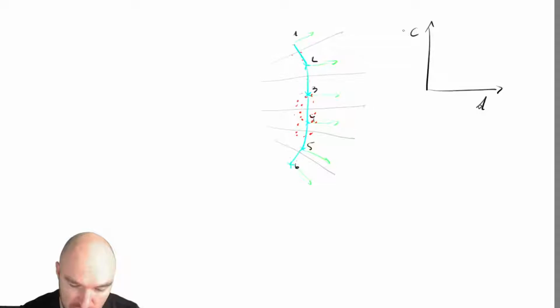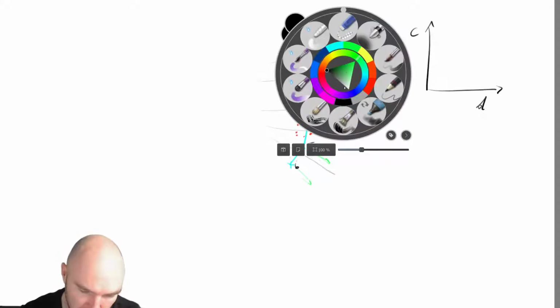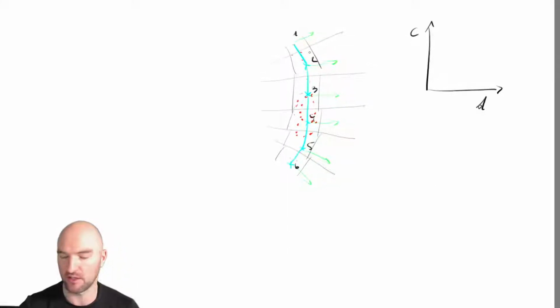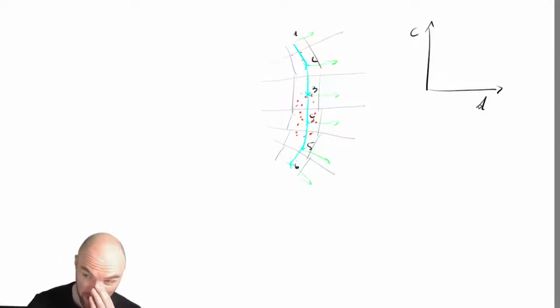Okay, and this is really the basis of our analysis in this case. And of course, you can use it to do concentration mapping as well, because just like before, you could just say, okay, I want all of the atoms that are within a certain distance of this interface, yeah? And then I might want to calculate the concentration for those. You could have done that, by the way, with our voxelization just earlier.